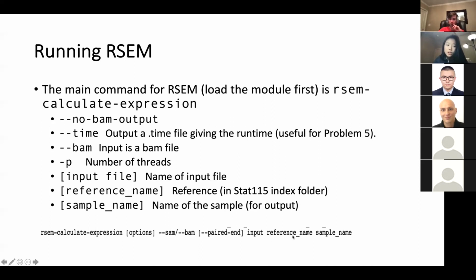Yeah, I used the exact order you were showing. Did you load RSEM? Oh yeah, I assume you loaded it, otherwise it wouldn't give you an error message. It's okay, I'll try it. Do you mind emailing me your bash code, somewhere nobody else can see it? Sure, thank you. I'll at least take a look at the line and see if I can find anything.